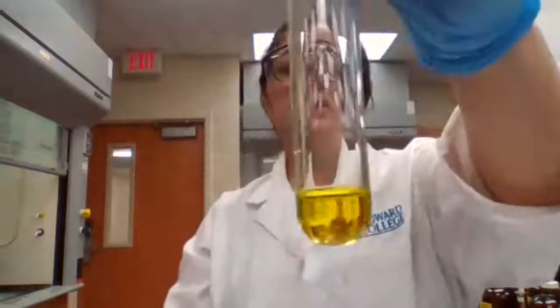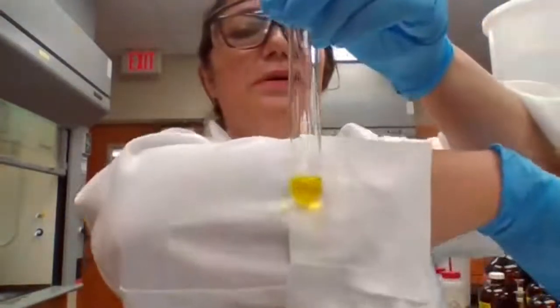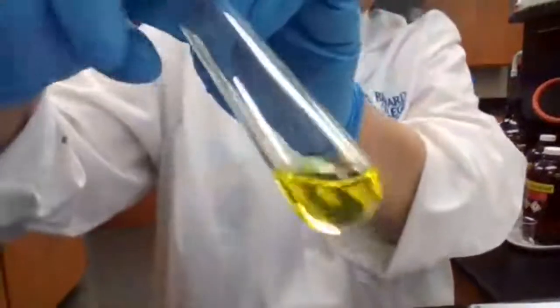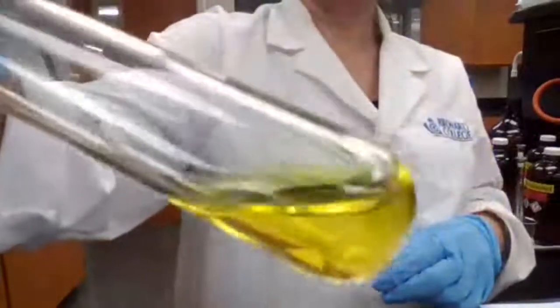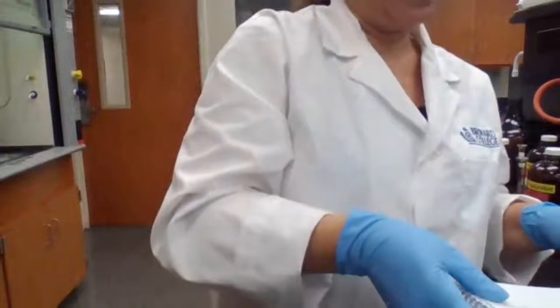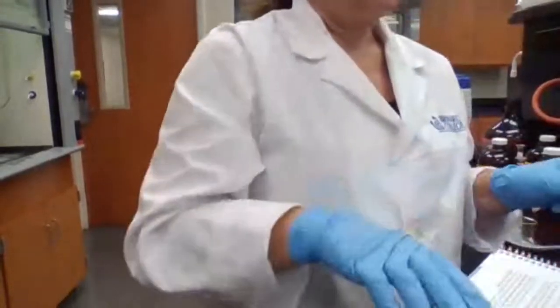I added 1 milliliter of potassium chromate into a clean test tube, and I want you to record the color. With the white background, record the color. I'm trying to get you the best angle, so the color in the camera shows as the color that I have here. Okay, you can record the color. This is just the potassium chromate.